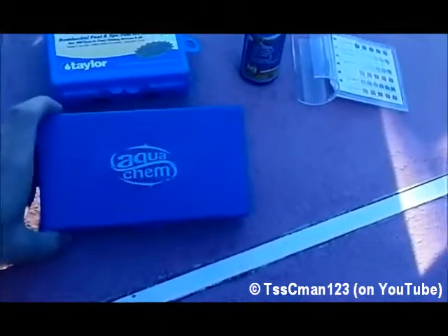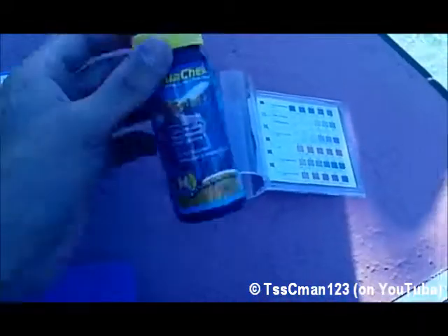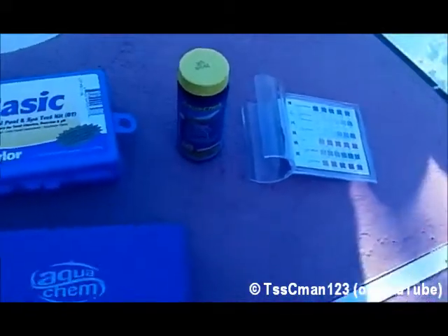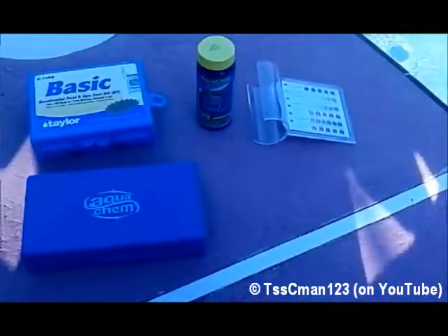I will be comparing an Aquachem basic test kit with the K1000 basic test kit by Taylor and the Aquachek test strips, residential kind not the commercial kind. I'm going to fill these up with water and we'll test these on camera and see how they compare.